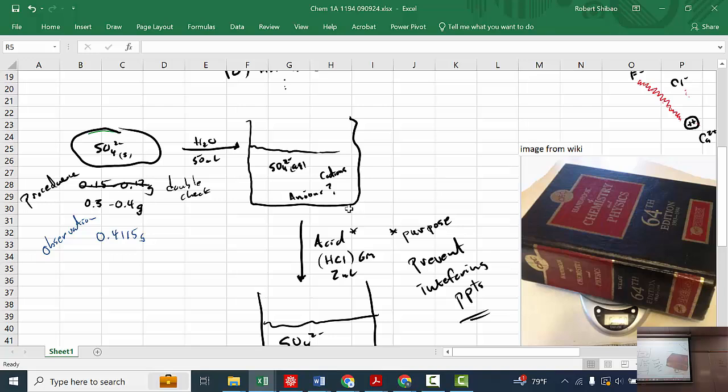And so if you see somebody with hydrochloric acid in their eyes and they're in pain or something like that, then help them. Help them to the eye wash fountain. Do you know where the eye wash fountain is? We have one here, but this one's kind of far. This one has 4, and then there's no drain. This drains just on the floor. So if possible, use the eye wash fountains at your sink. Do you see the eye wash fountain at your sink? So you could use those, except if the caps are on or off, you want to just spray a little bit to wash anything that got stuck in there off first, and then hit your eyes. And so go to the sink and use the eye wash fountains. And then how long do you need to rinse for?